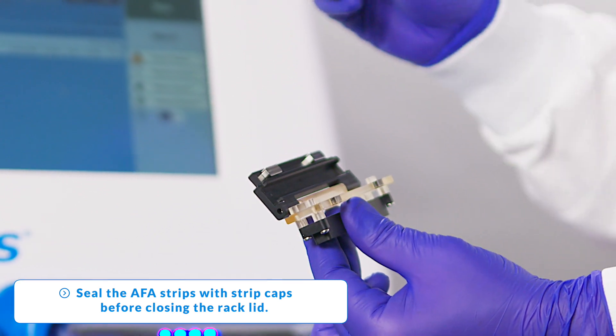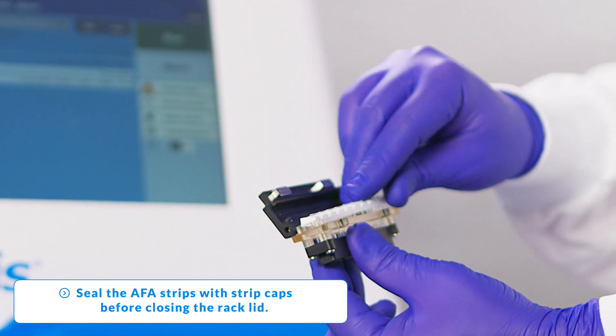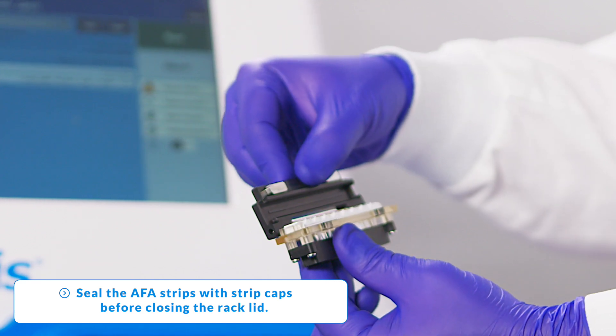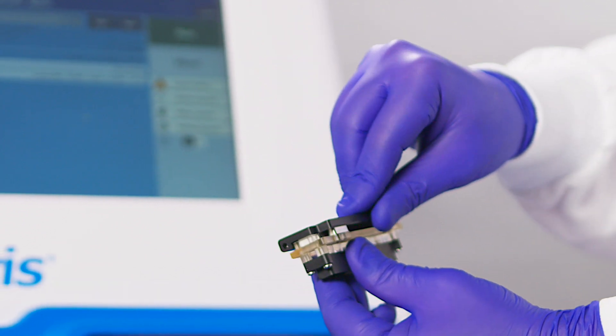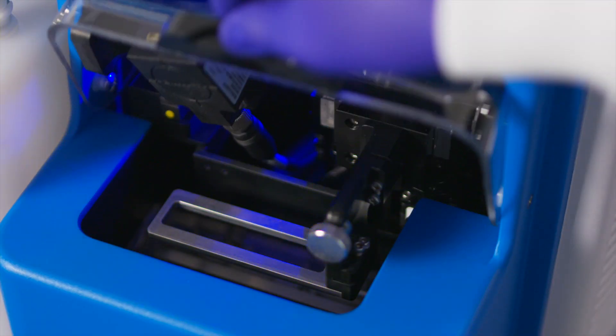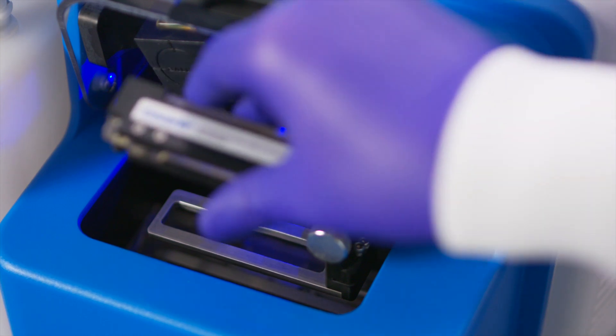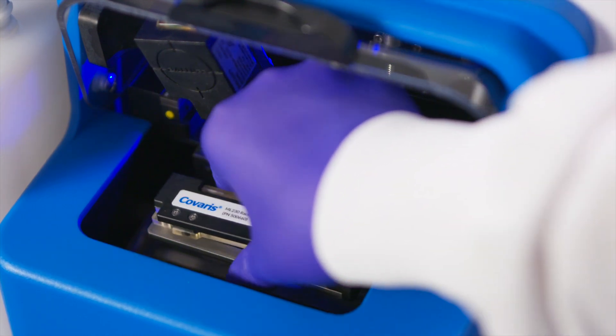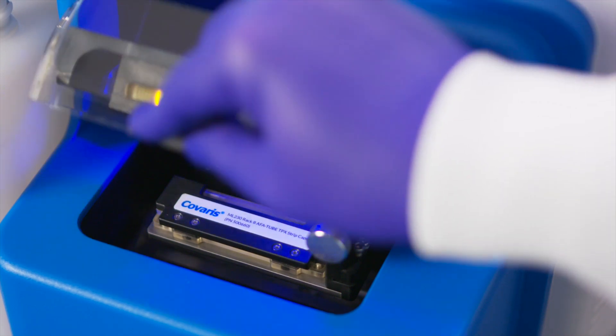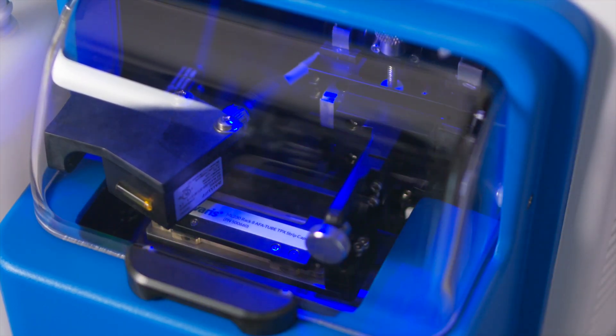Open the hinged rack and insert the 8-AFA tube TPX strip. The rack is keyed so that the strip only fits in one orientation. Close the hinged rack cover to secure the strip. The cover is held in place with magnets. Open the ML230 safety cover and place the tubes and rack assembly into the sample tray. Close the safety cover to ensure that the door status in Sonolab turns to a green check.